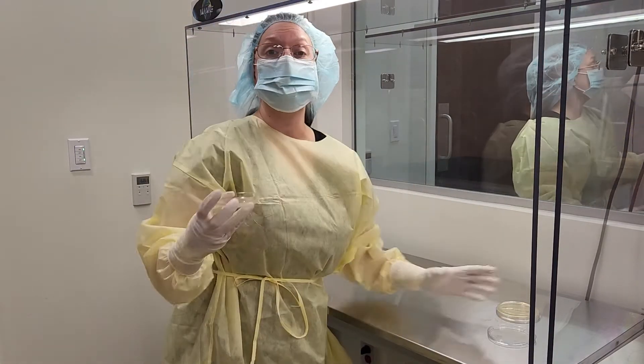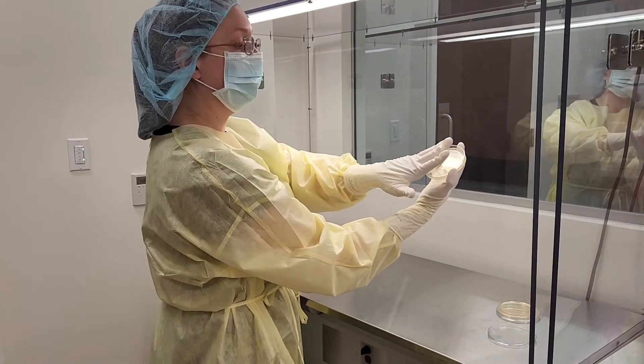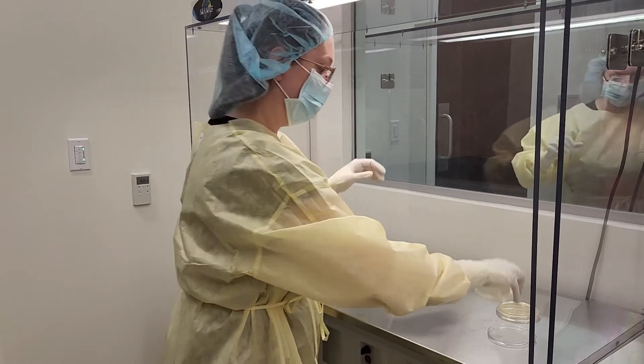Obviously this is going to be handed to you. Start with the pinky. Do not touch the plastic around the edge of the plate. One, two, three, four, five. Light touch. Don't dig into the agar. Alright?